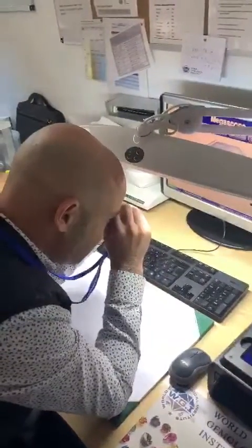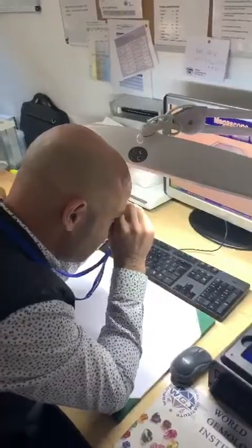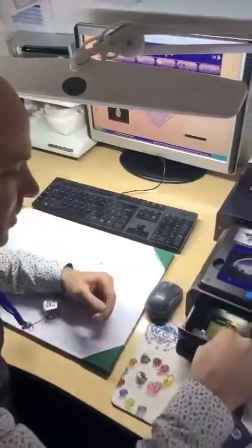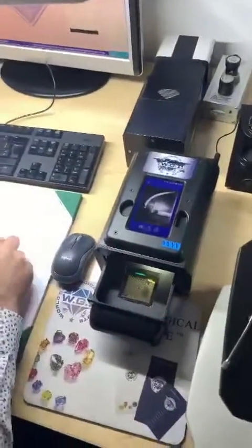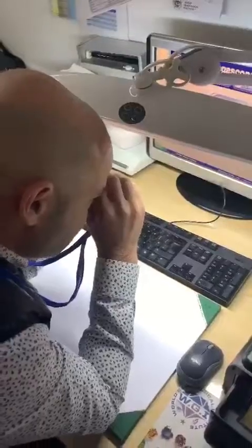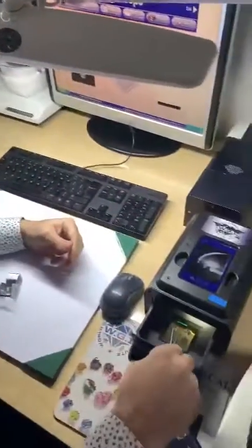First, we check the princess cut — you can see it looks like a diamond with some inclusion. We put it in the device. Second is the round brilliant — we check it also; it looks like a diamond with SI clarity and good color.